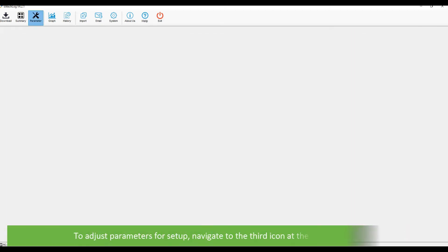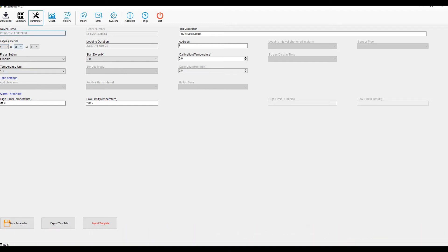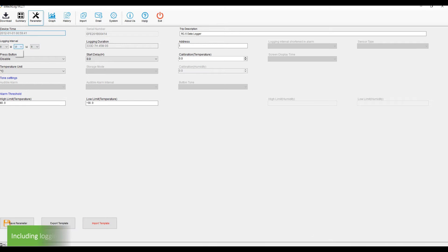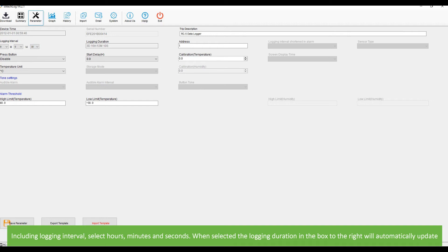To adjust parameters for setup, navigate to the third icon at the top, parameters. On this page you can set up all required logging parameters including logging interval. Select hours, minutes and seconds. When selected, the logging duration in the box to the right will automatically update.